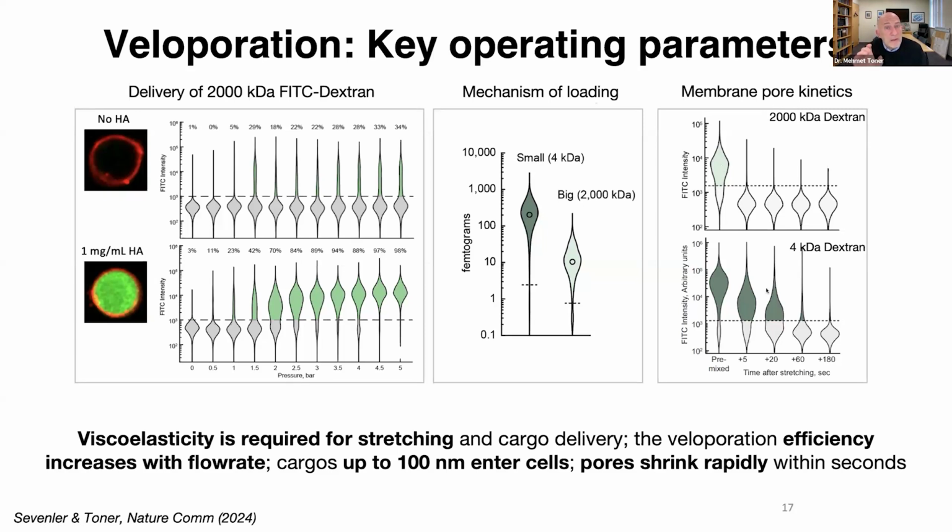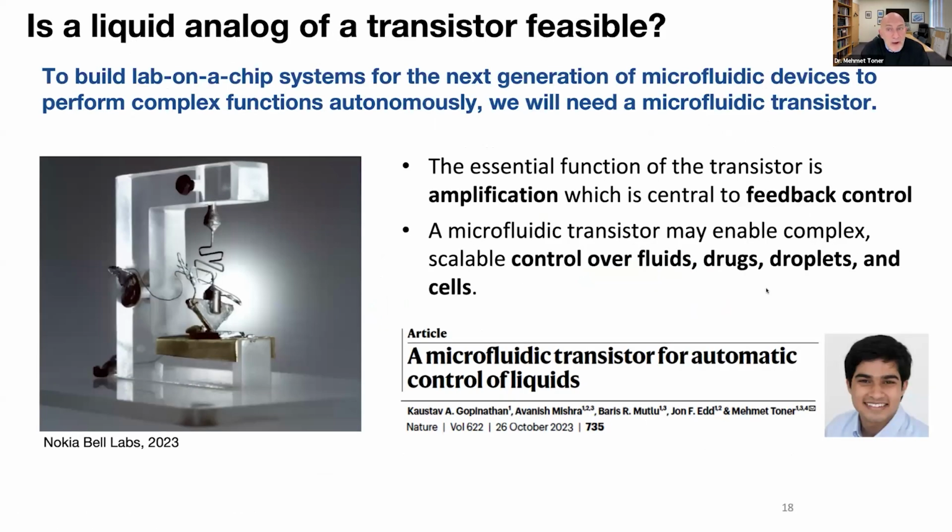It's only a 1 millisecond exposure to the active region. It's a brilliant way they're designed to porate cells at extremely high throughput, where we could actually porate trillions of cells within hours.